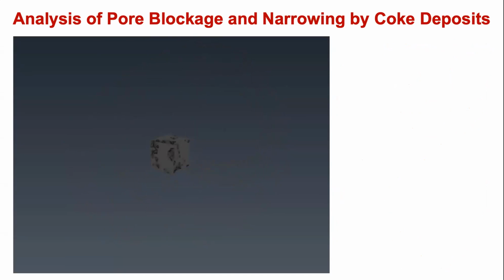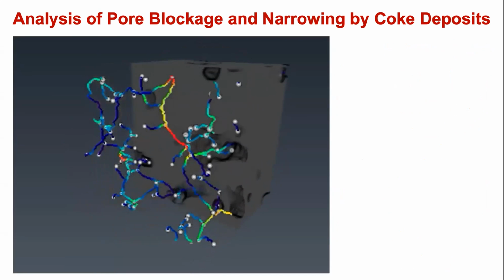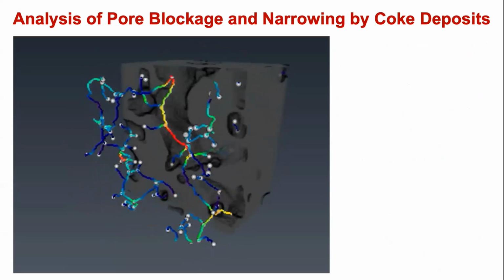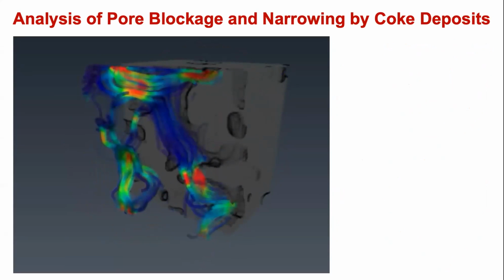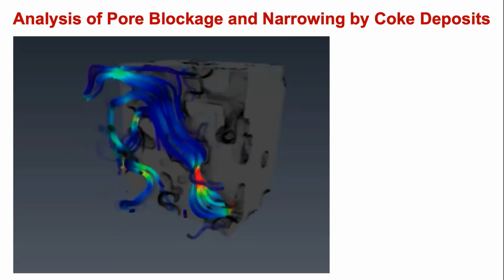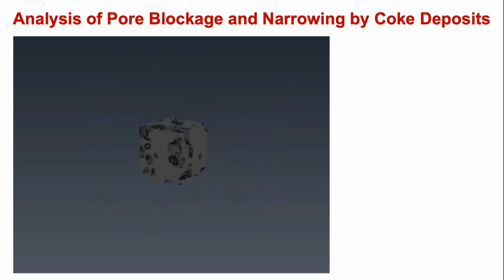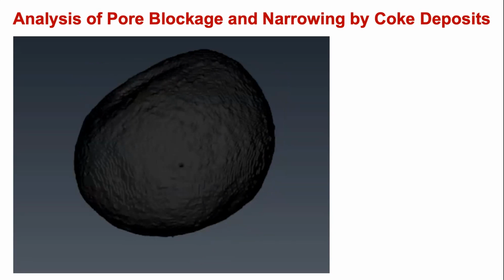Here, so we take this volume, and we now say, this is the roadmap, and now you can just have molecules in a computer flowing through that thing here. These are the channels where molecules can go through. And now we open up the thing and then you see the different molecules. So this is a computer taking the model from the X-ray tomography, I have to say. And then you just say flow where you can flow.